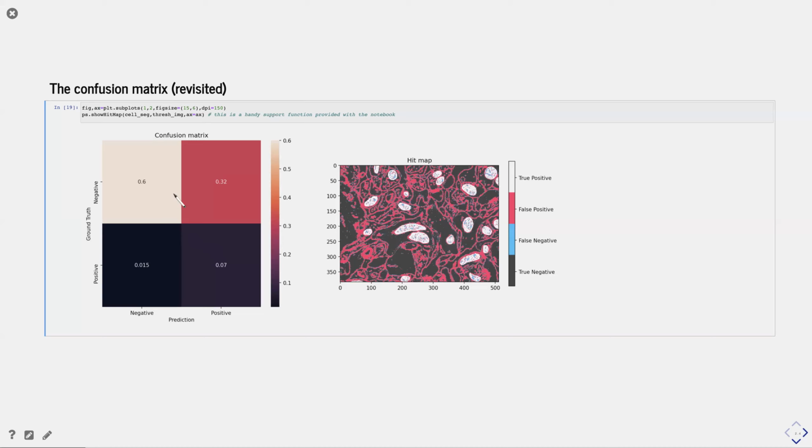You can have different representations of the different features in the image, and you can truly see that there are not so many mitochondria within this image, so it's natural that this one is much smaller. Most of this should actually move over here, so we should have nearly 90% as background. So this gives us a quick overview of how good our segmentation is. Other metrics we can use are precision and recall.